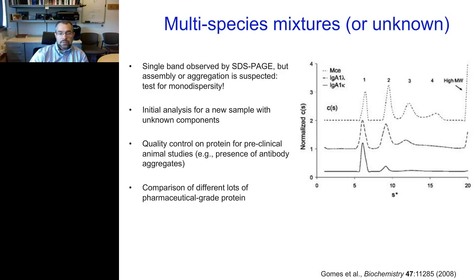And even for early stage comparison of different batches, different lots, or as you're approaching formulation studies for early stage development, AUC is a very powerful technique for that sort of approach.